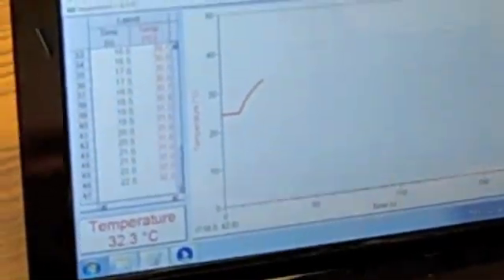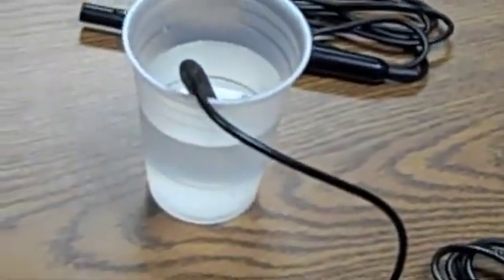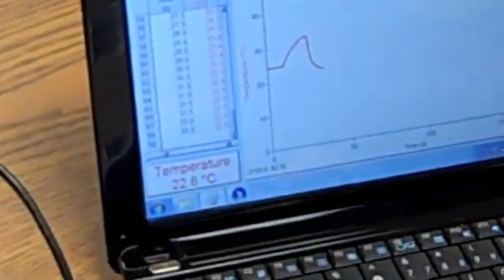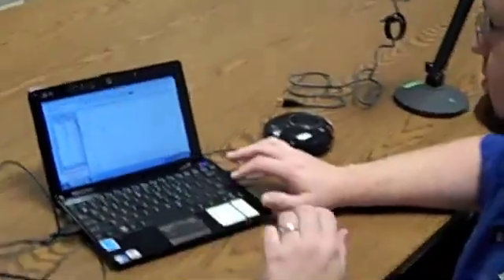Great, so basically what we're doing is we're able to hear what normally somebody would be able to see happen on the screen. 24.2, 23.2, 22.7, 20 space, not complete. Automatic attack, tag, can't enter. Automatic sensor.